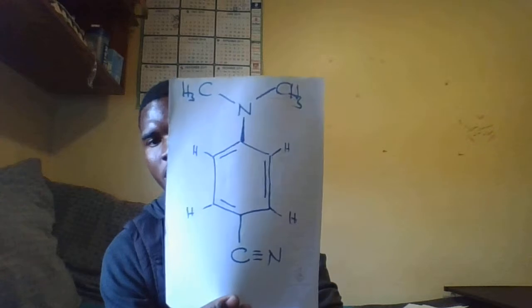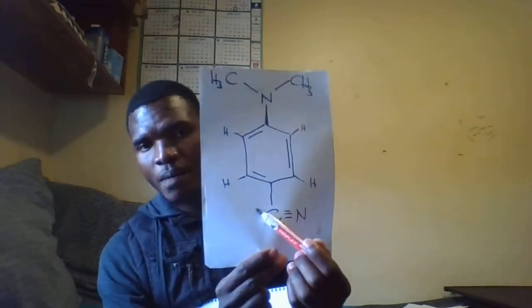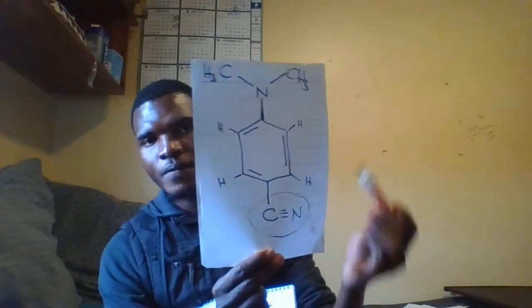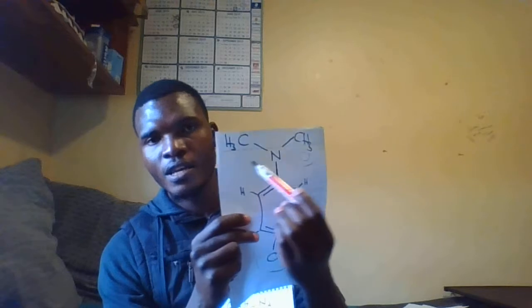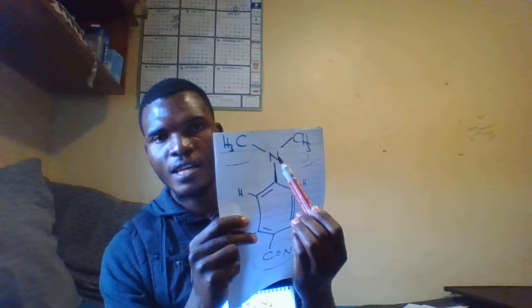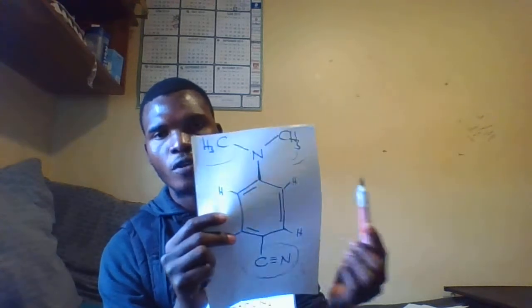When I just Googled, because in my mind, remember, I was expecting to see a carbon to nitrogen triple bond, right? I was expecting to see the CH3 carbons. And I was expecting to see the CN carbon to nitrogen bond, if you remember, from the carbon NMR. I'm just gonna show you now the carbon NMR.